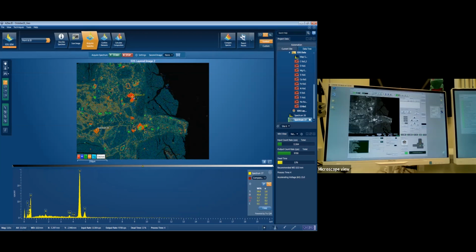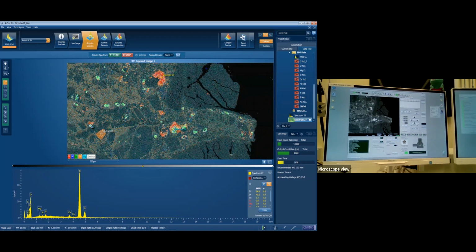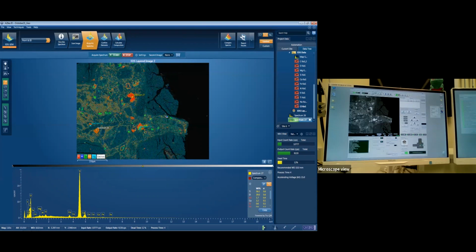Also a fun little fact for you: apatite is basically the same mineral that your teeth are made from. The fluorine version, which is why everything needs fluoride in it, because that's what your teeth are made up of. Probably shouldn't be chomping down on apatite though. Digestively, probably not the best thing for you to do. It'll probably cause more harm than good.